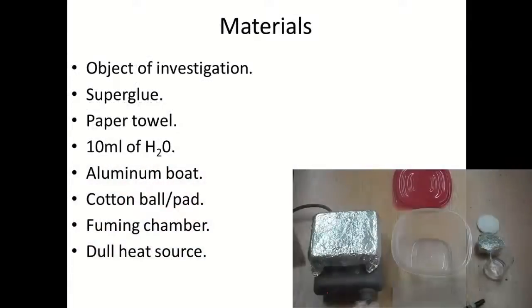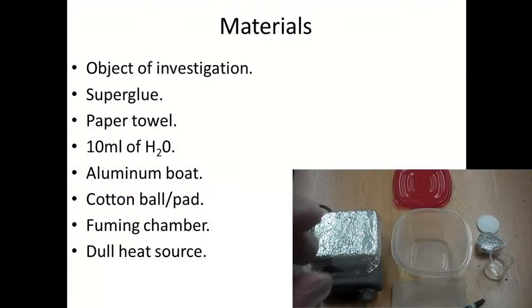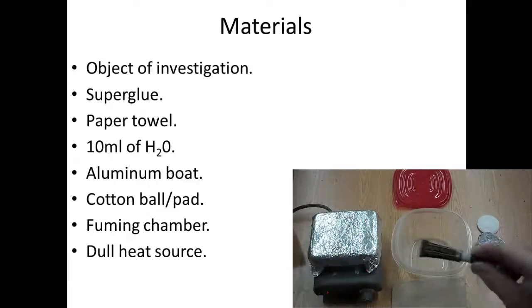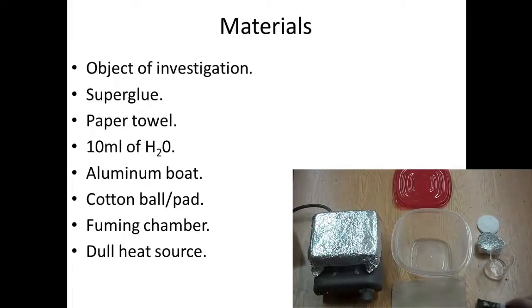So this is what you're going to need to get that started. You're going to need your object of investigation. In this case, we're going to use a microscope slide, a glass microscope slide that you've already placed your fingerprint on. We need some superglue. We'll need a paper towel and 10 milliliters of water.